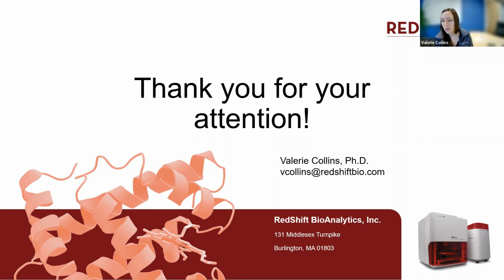All right, what about using lipids or detergents? So we've tested a few detergents. Lipids, it's something that we're learning about. We would love to collaborate and learn more. The thing that is really important about doing our measurement is that it's always very clean buffer subtracted. So if your sample is in, say, a lipid nanoparticle, I know those can be very heterogeneous, so that can be hard to get a correct buffer match to do that background subtraction. So it would have to be done kind of in pieces, and we'd be happy to collaborate and learn more about that application.